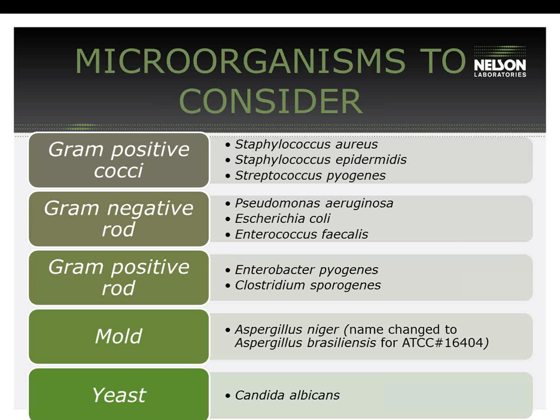The organisms can be tested individually or as a mixture. The results are more valuable if they're tested individually because you can get a log reduction value for each organism, and therefore it allows you to know how well each organism works with the decontamination process. One organism that we recommend to test for is Clostridium, since this is a reoccurring organism that is a problem in the tissue industry right now.